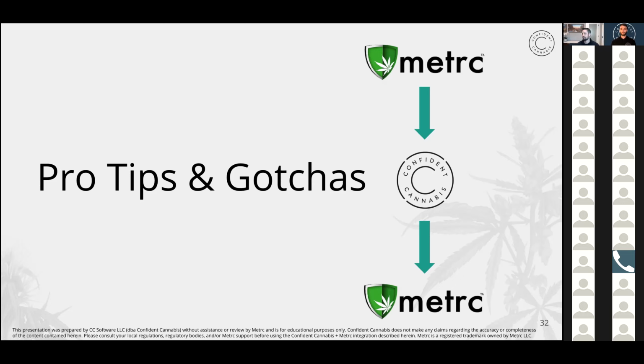That's a good reason why you would want to cancel the transfer or reject the transfer in Metrc. There are rules and they vary state by state, and I don't want to give regulatory advice, so you should definitely check. But I know that in most states, you have a little bit of wiggle room. So if the transfer says 10 grams and you actually receive 9 or 9.5, there's a window of like plus minus 10%. Don't quote me on the 10% number, but there's a small window where you can still receive the transfer, but when you receive it, in all cases, you have to enter the weight that you measure. So they might say 10, you might get 10.1. They might say 10, you might get 9.5. That's okay. So you enter the 9.5 and you don't want to reject it.